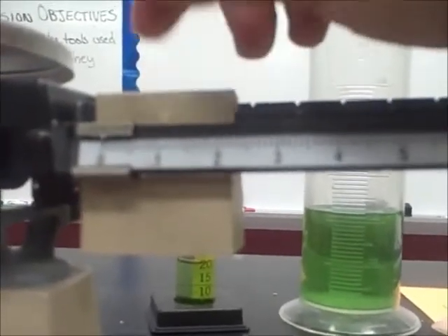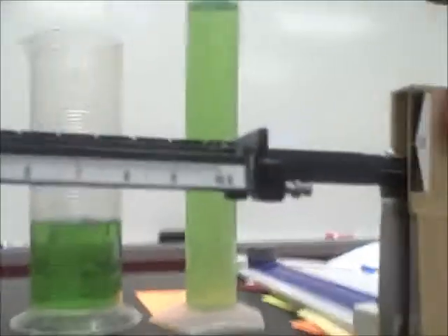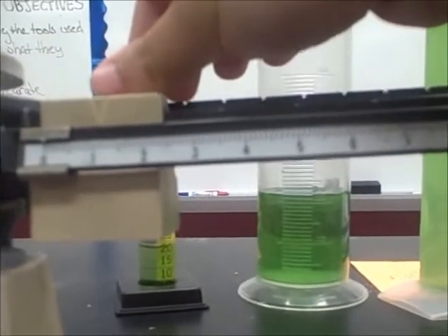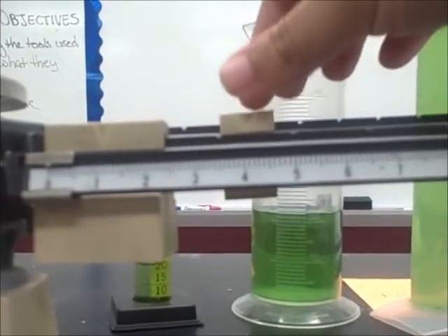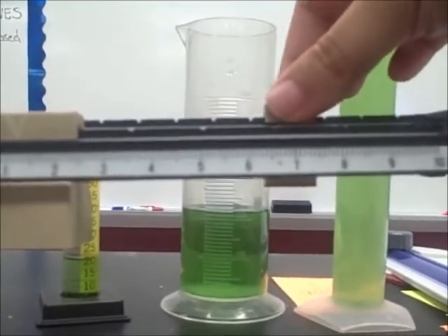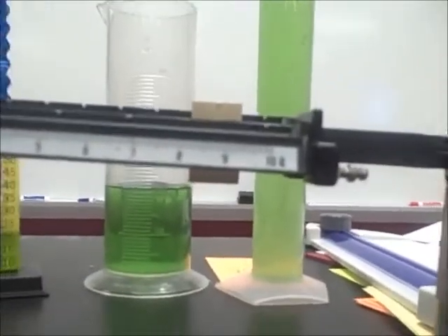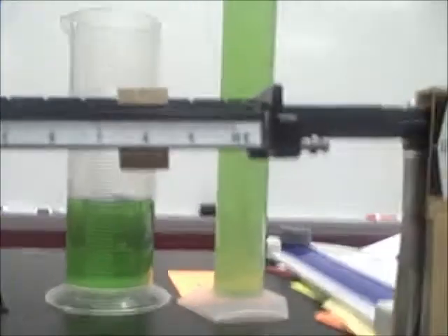We're going to start with our heaviest rider, which is the hundreds in the center — you'll always start with the heavy one. Notice how it goes all the way down; that's too much weight, so we're going to move this back. Now we'll move the rider in the back until it drops down again. Once it drops down, that tells us the beams are too heavy, so we move this back to where it pops up again.